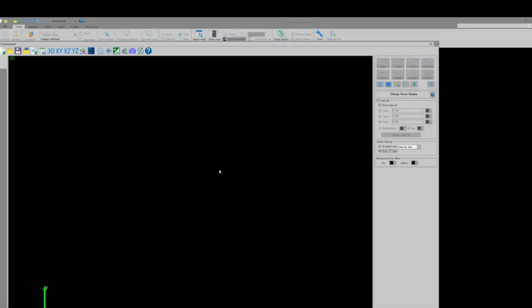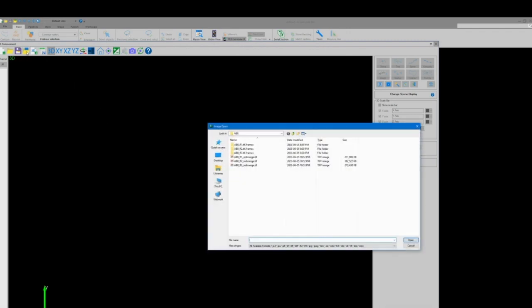In our 3D environment we will go to the top toolbar and select the icon that says open image file, selecting the stack that we saved in our previous step.